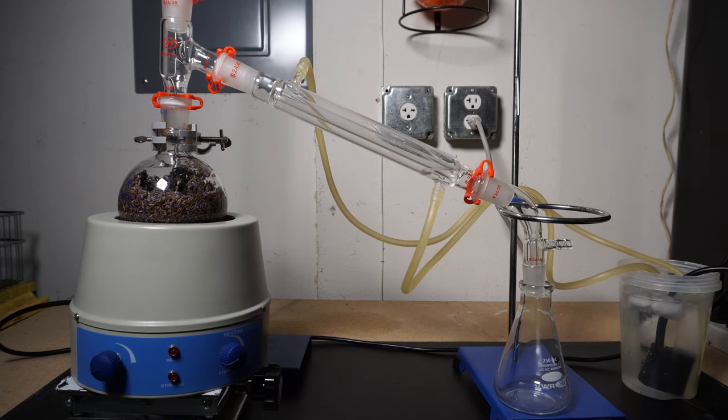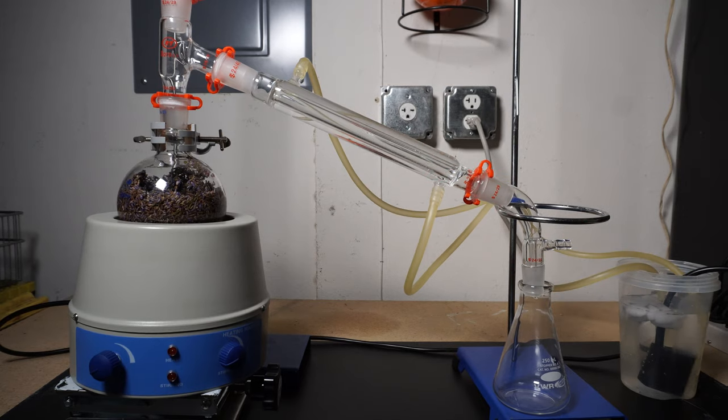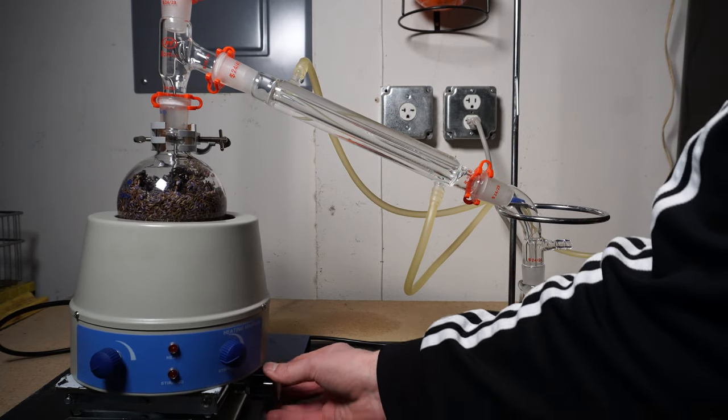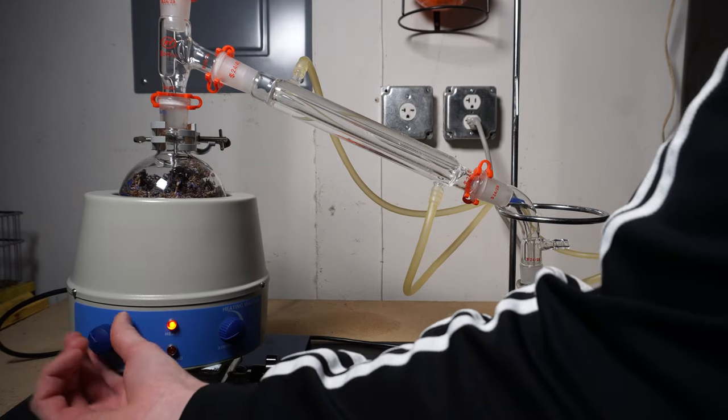Following this I set up a short path distillation apparatus and turn on my condenser. Hydrodistillation is ideal for pulling oil from organic materials. Water makes the last separation much easier and the product will also be free of any other solvents like ethanol.